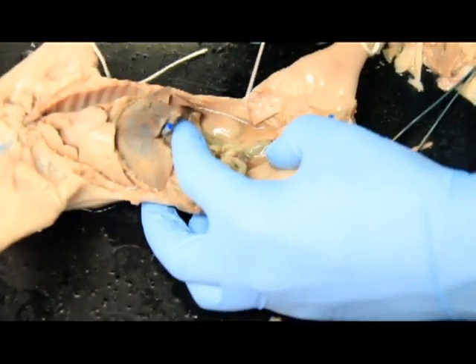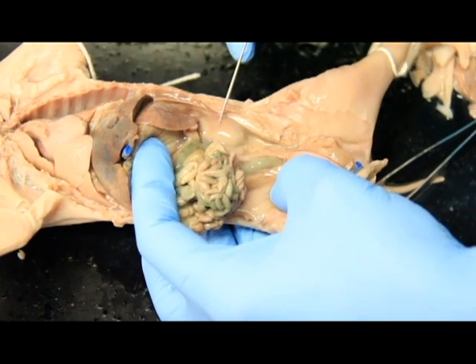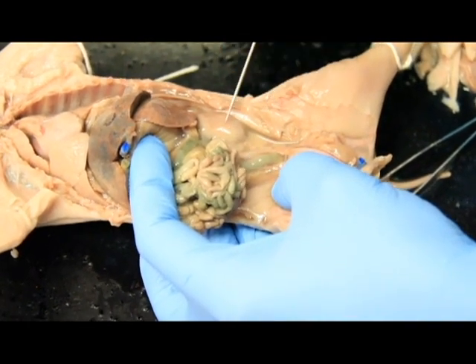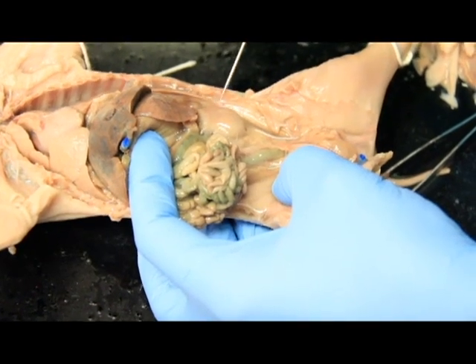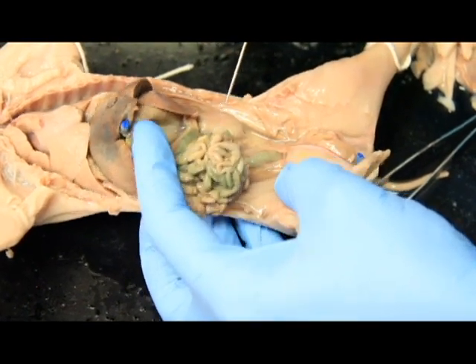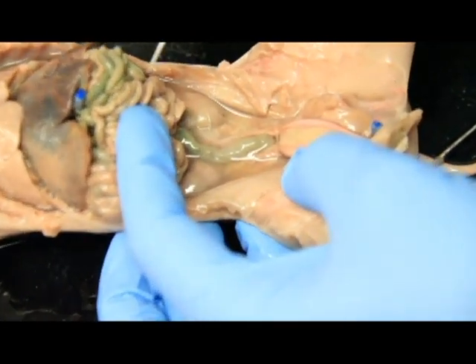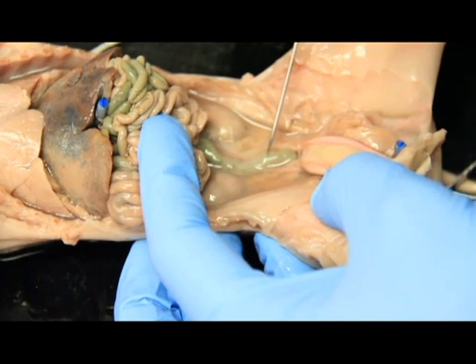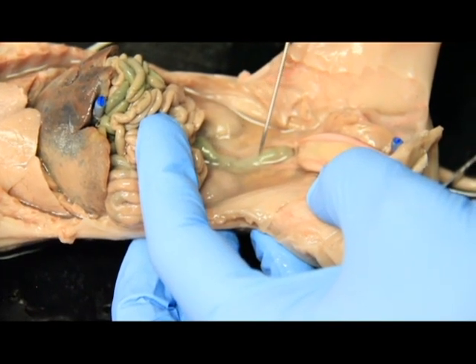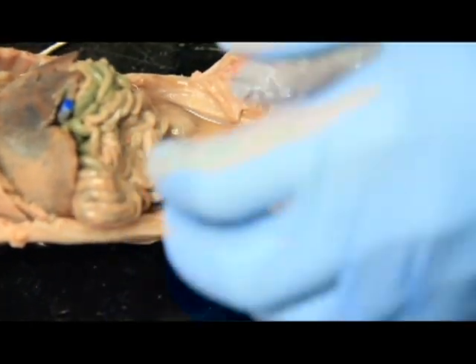Okay? And then on either side here, sorry, you can see it's a little wet, but you can see these giant bean-looking things, and that's going to be on either side of the pig. These are his kidneys, right? You've heard of kidney beans? These are giant kidneys. And if we follow it down, in between the kidneys, heading from the spiral colon down towards the anus, this is going to be your rectum, right here. And this is where non-digestible material passes through, and then out towards the anus.